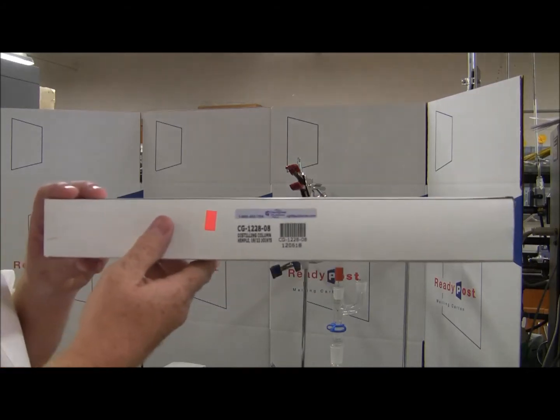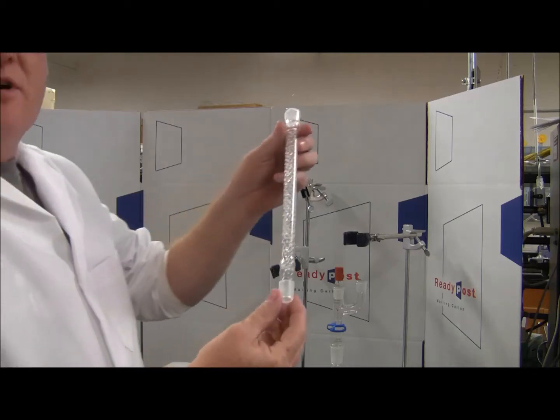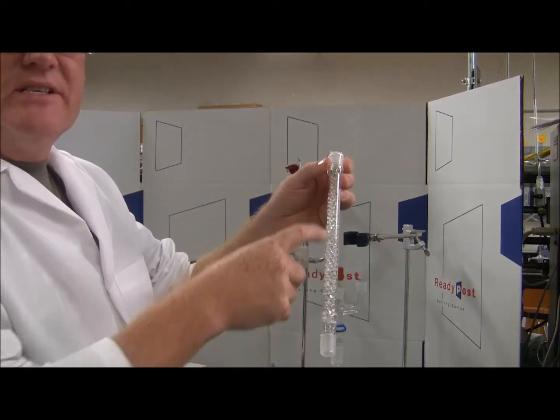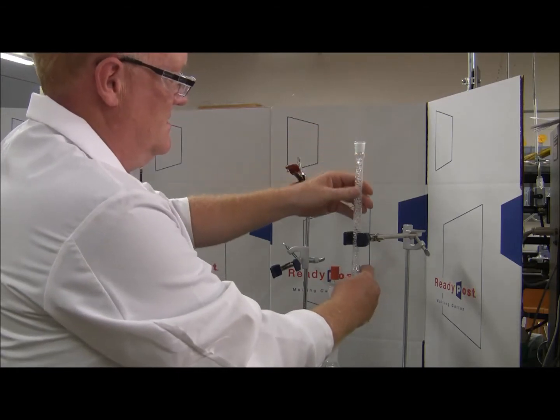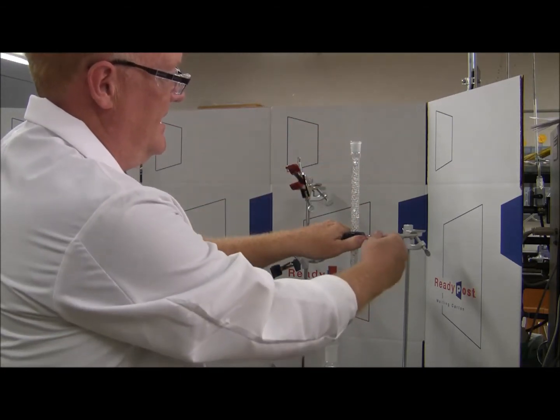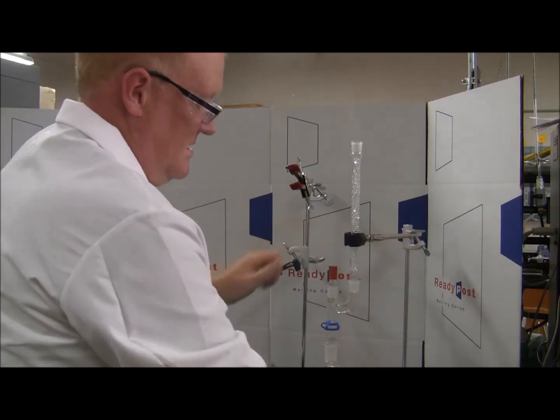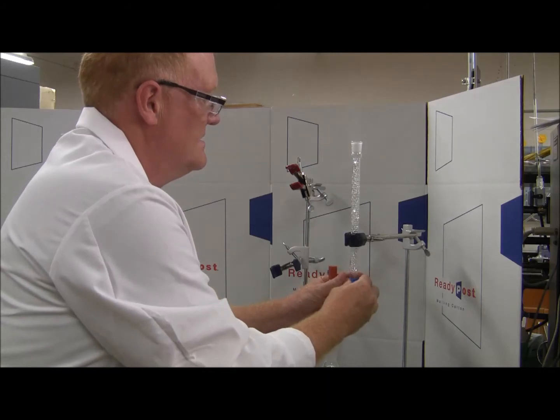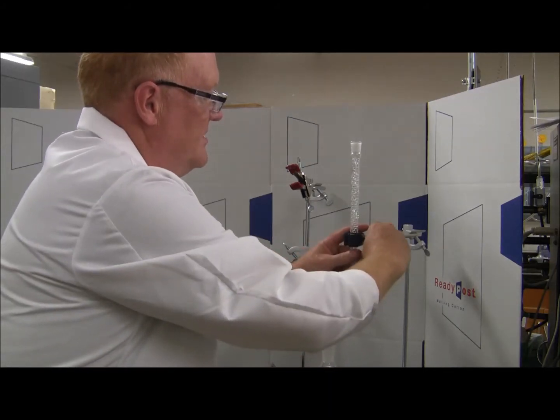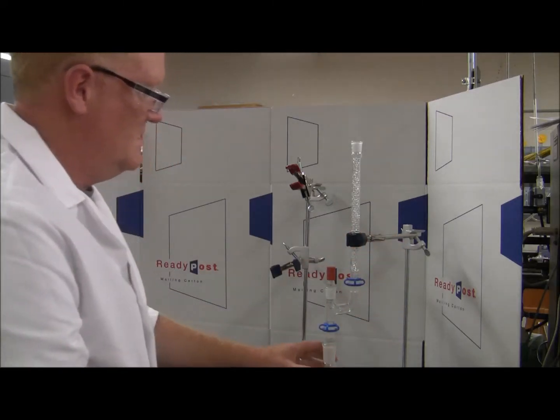Okay, next we're going to add our distilling column. I've already preloaded the glass beads within the distilling column. The glass beads do come with the kit. Assemble that next. Take down the fixture. Once again, use the blue clamp. Everything's all snug up in here. We're not going to have anything falling over or tipping over. All right.